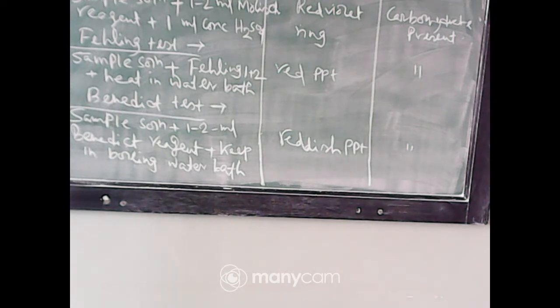Molisch test, Fehling's test, Benedict test.